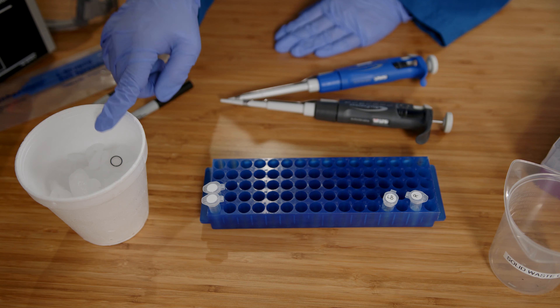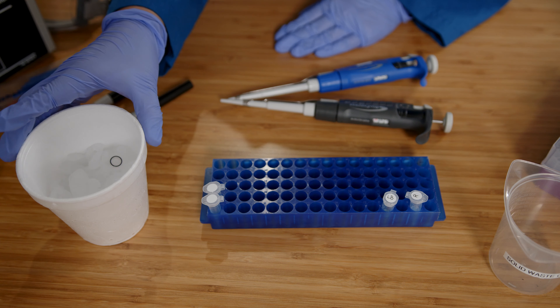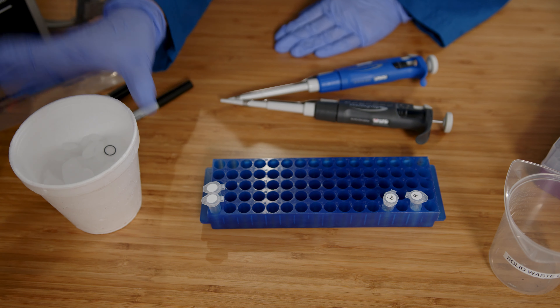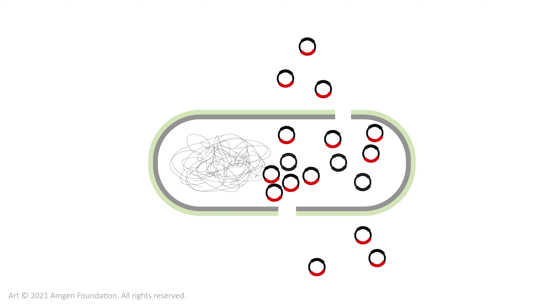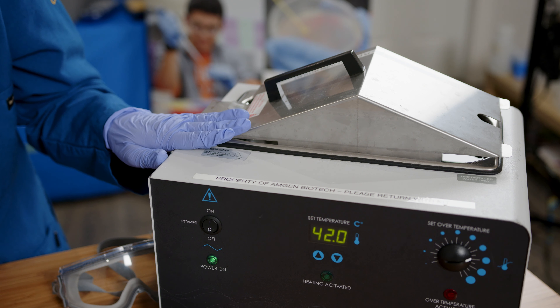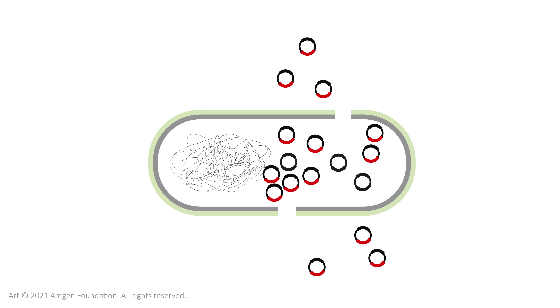I will combine the competent cells with the plasmid and keep them on ice. Keeping the E. coli cells as cold as possible helps to keep them open to accept the plasmid. Then I'll use the water bath to heat shock the cells, which causes the adhesion zones — gaps in the cell wall — to close and trap the plasmid in the bacteria.